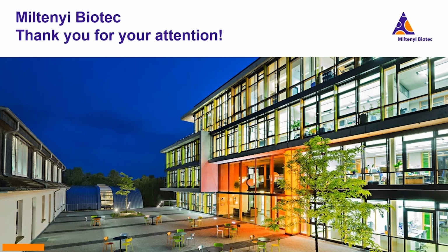So we have isolated nuclei and then used this particular antibody, and we saw that, let's say, all nuclei could be stained with this one. I'm sure I've heard about two different antibodies, and I can look it up and send the results from our hashing experiment if I can get the email address. Cool. Thank you very much.